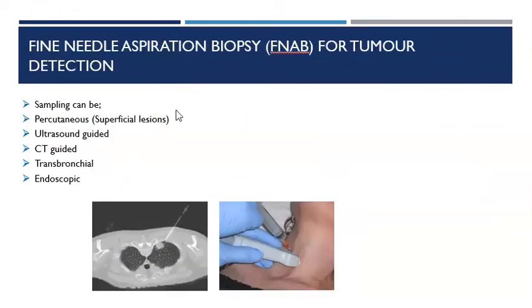And this is just shown at a much more accessible site, shall we say. So fine needle aspirate biopsy can be done under ultrasound guidance if it's a slightly deeper site, and we are injecting a needle into the lesion, the tumour, the lump, and inserting that needle and then trying to withdraw a small amount of cells into the needle, into some fluid, which then can be put onto a microscope slide.